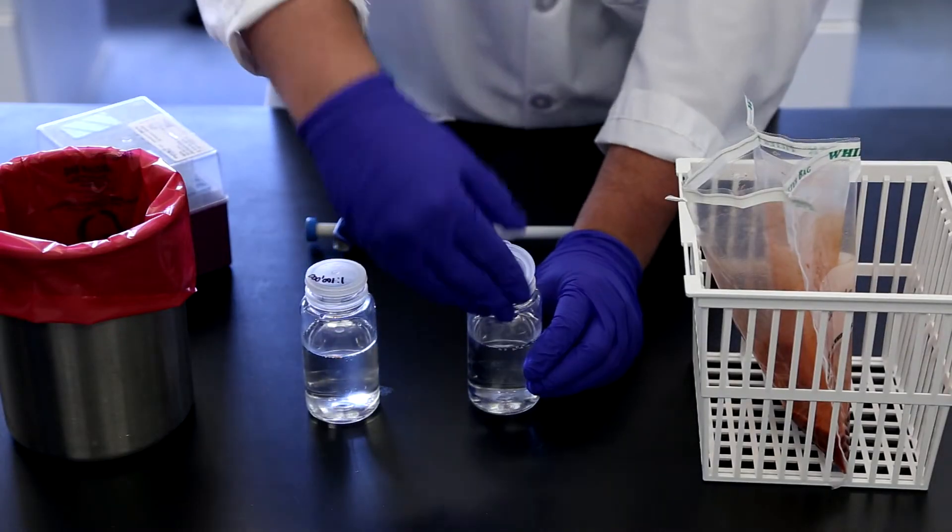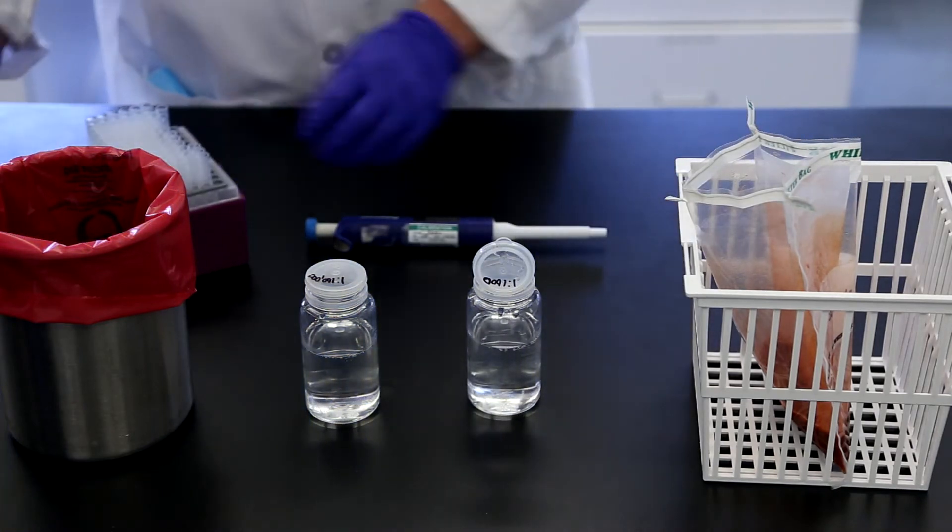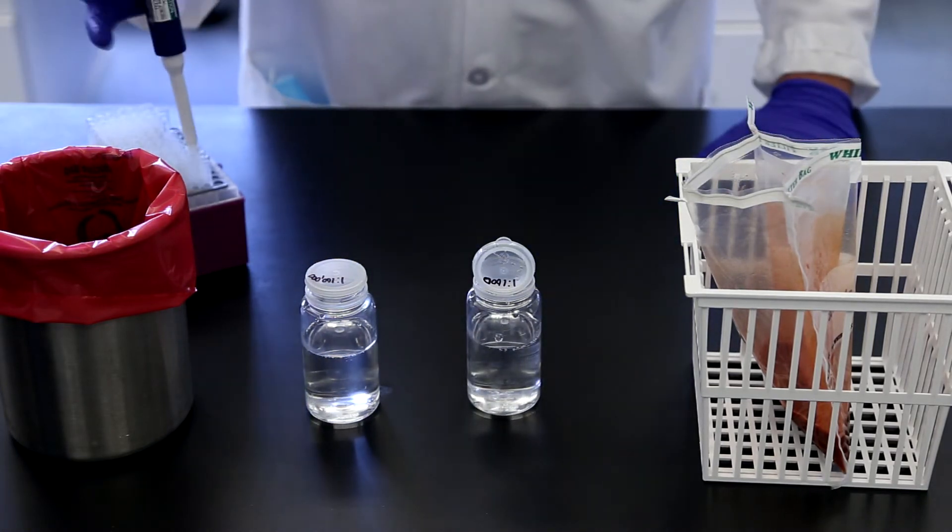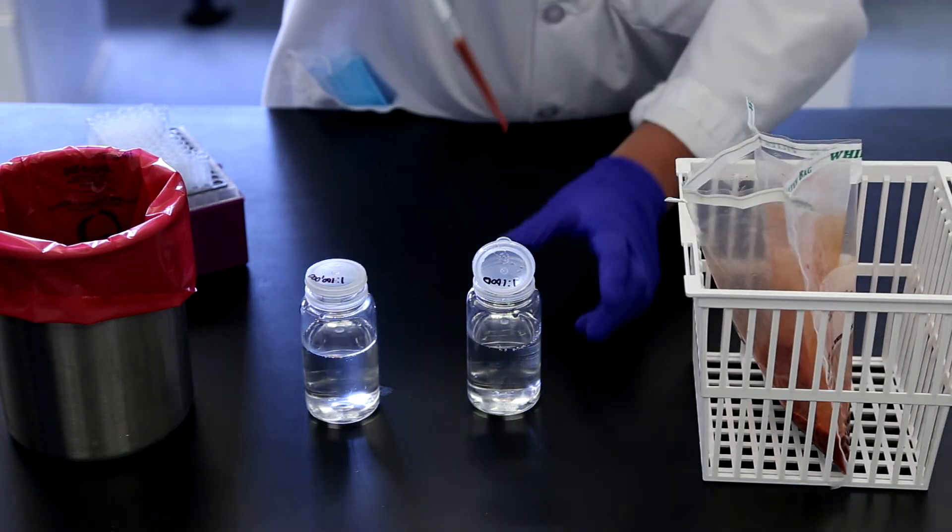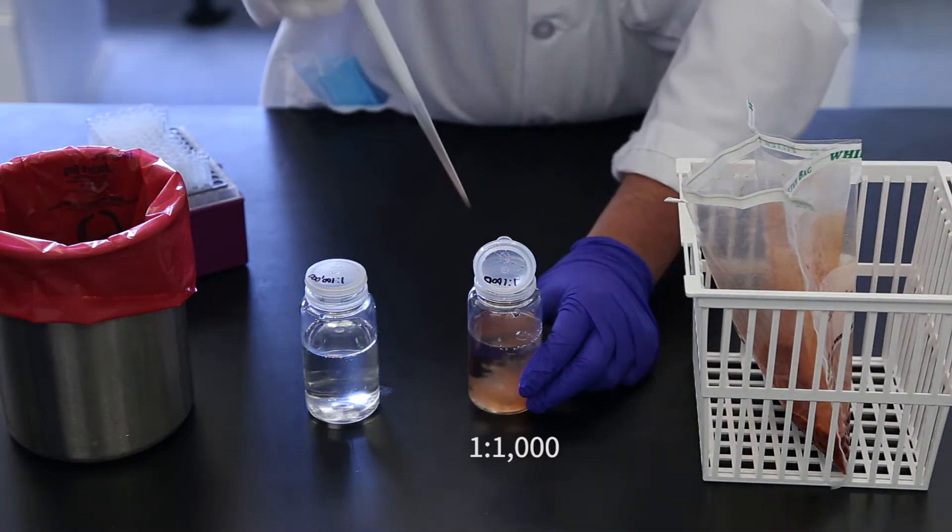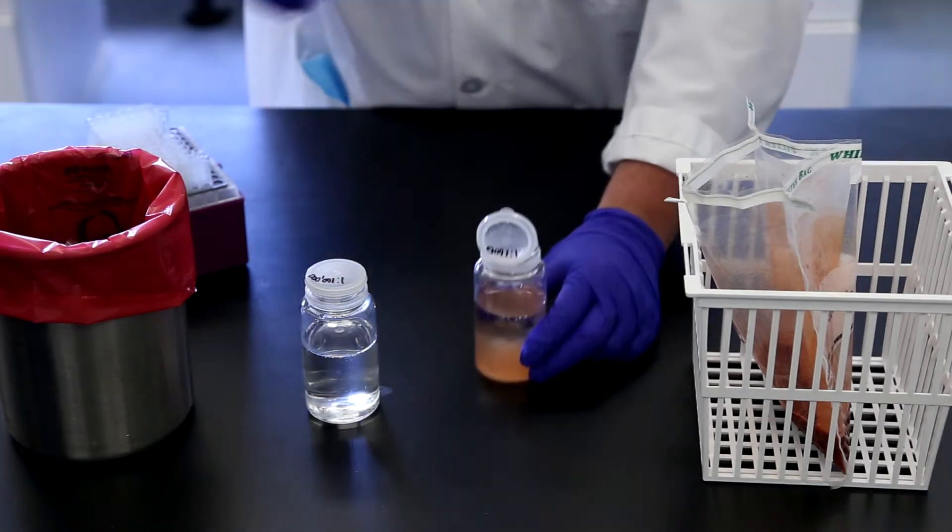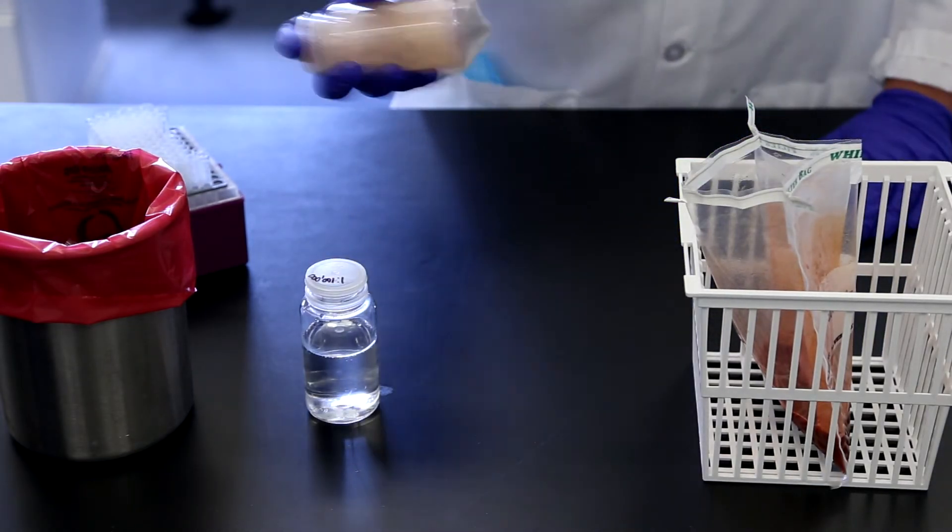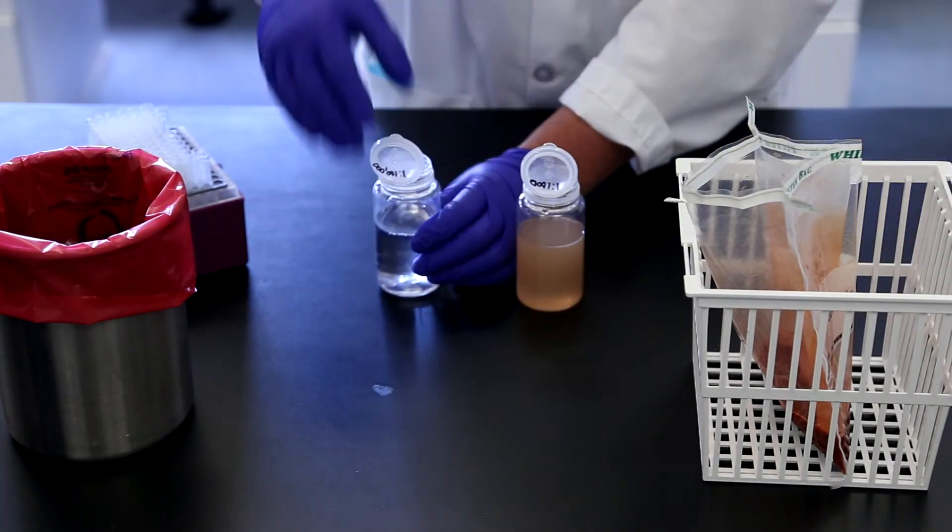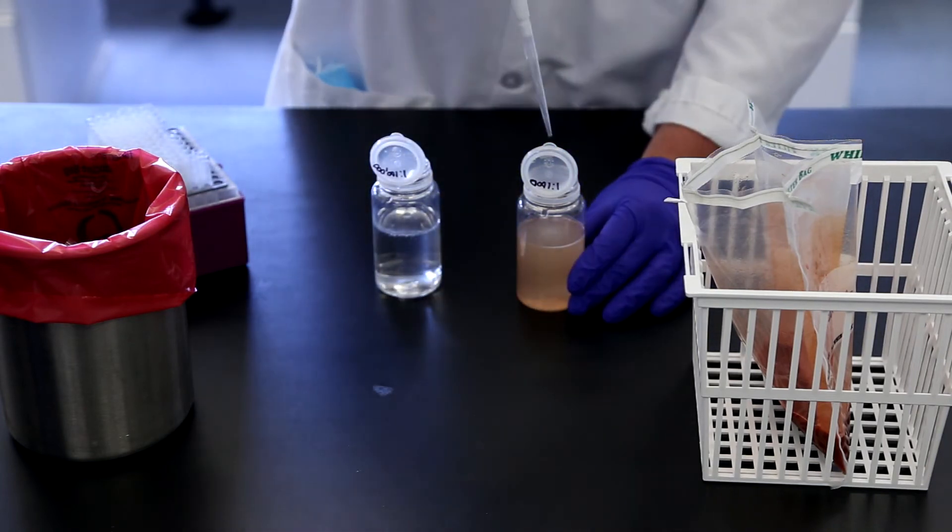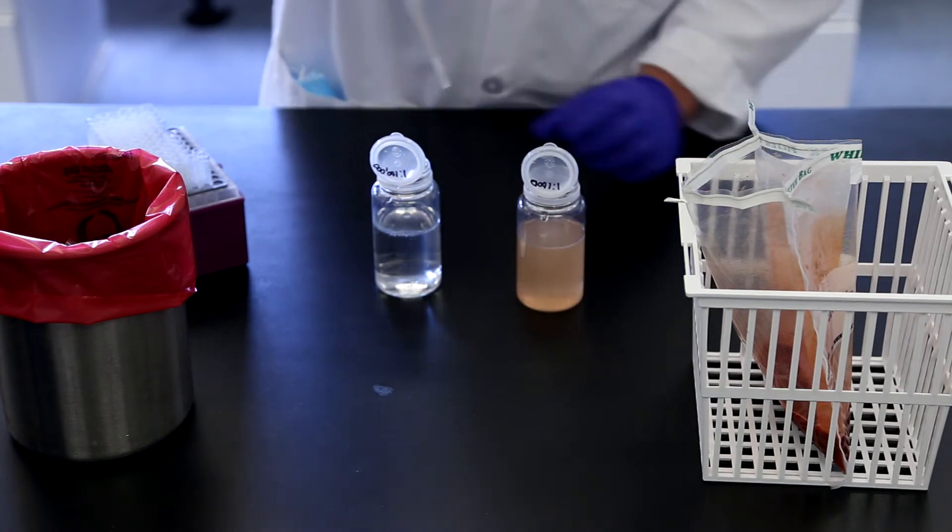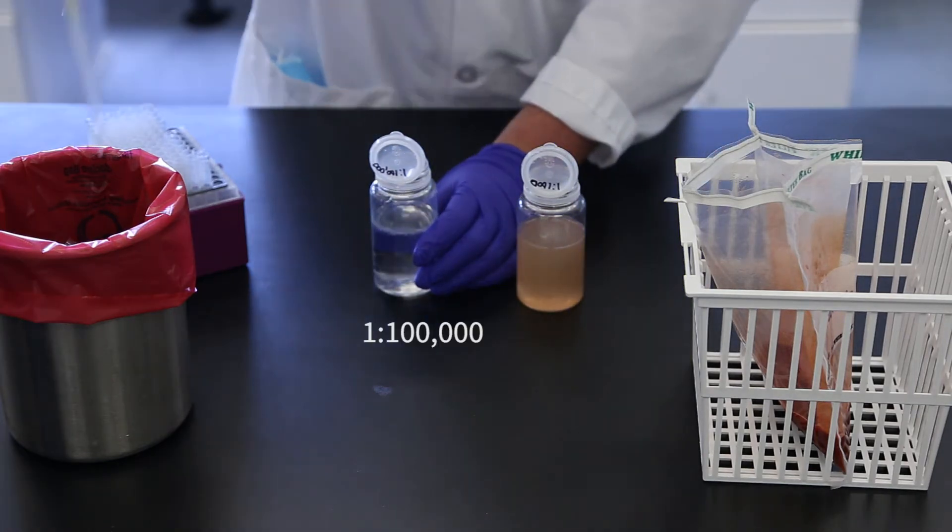Alternatively, some dilutions can be skipped to reduce materials required. For less than 1,000 CFU per gram, transfer 1 milliliter of 1 to 10 sample into 99 milliliters of buffer. For less than 100,000 CFU per gram, transfer 1 milliliter of 1 to 1,000 sample into 99 milliliters of buffer.